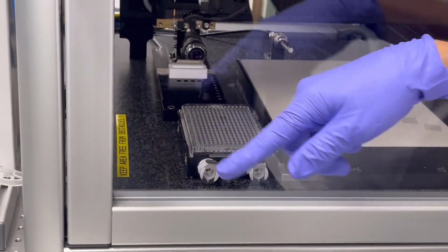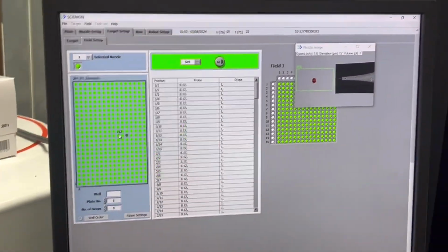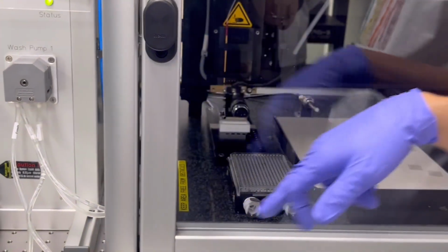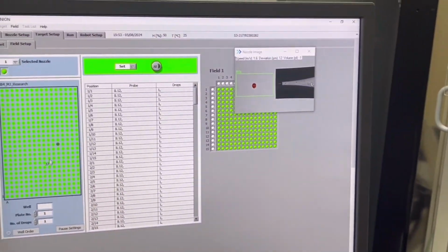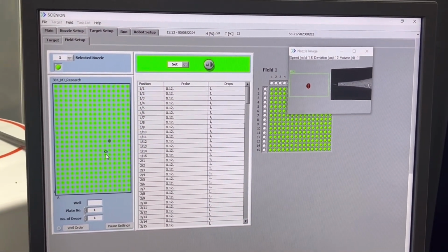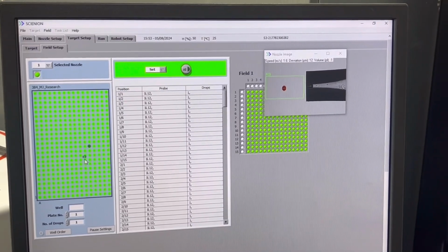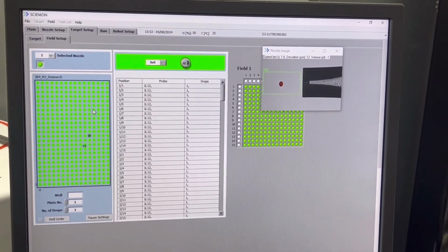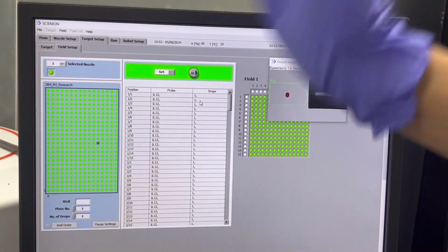The blade, the hole. What is the hole? I don't know. Yeah. And it's related to the position. Yeah, it's easy because when we point out the position, that will show the coordinator like the K9, something like that.